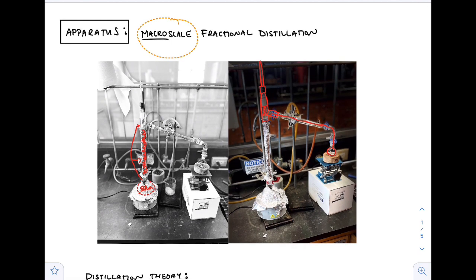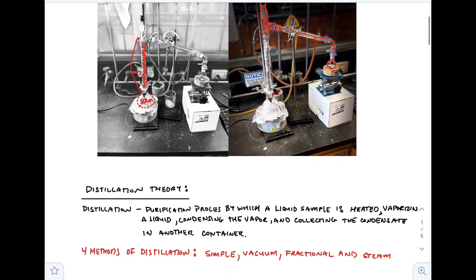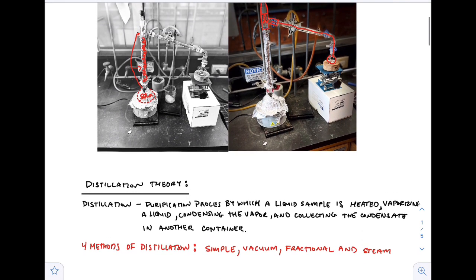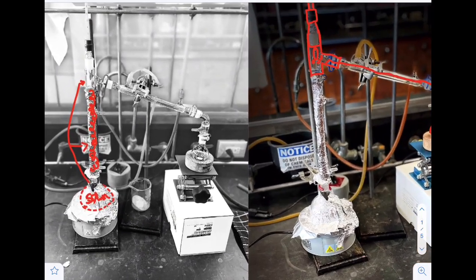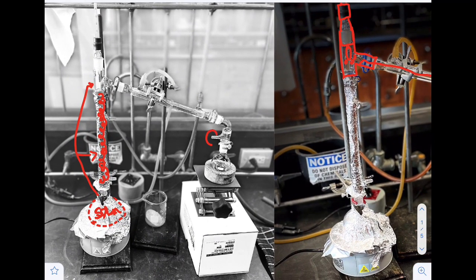So that's pretty much the process of distillation and fractional distillation. Now I'm going to go over the theory behind it. But first, I really want to just tell you about the distillation. There's four methods of distillation, right? So we have the simple distillation and the vacuum distillation, fractional distillation, and steam distillation. So we've done steam, we've done simple, and then vacuum we won't do, but just know that if you wanted, you can apply a vacuum to this.